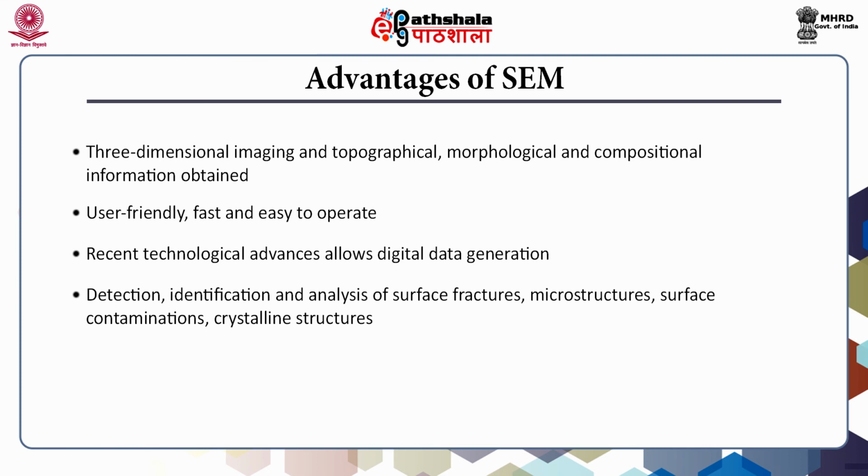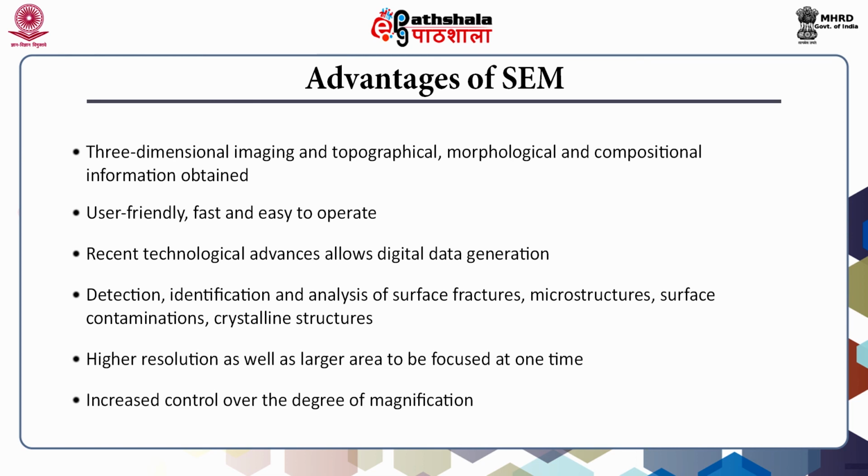The technique finds applications in detection, identification and analysis of surface fracture, microstructures, surface contaminants, crystal structures. It provides high resolution, and a larger area can be focused at one time as compared to traditional microscopes. We can have increased control on the degree of magnification.